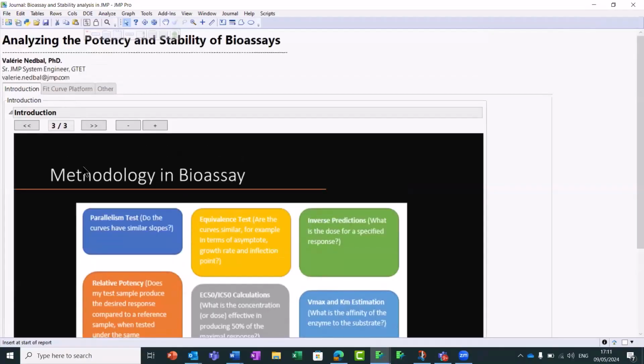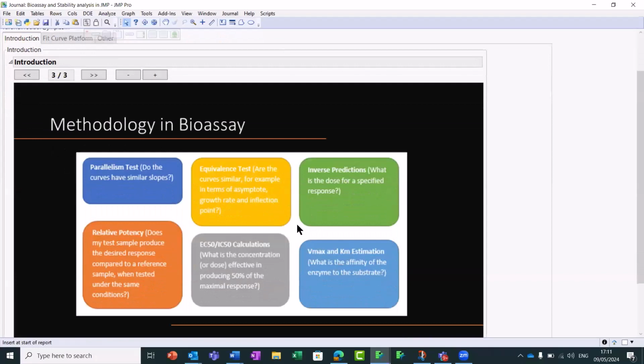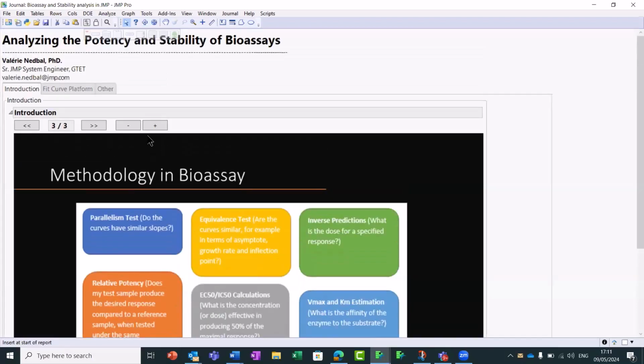First of all, where do you find all those different things? You might apply those response types of analysis. Those responses are obviously not linear. It could be linear, but I would say in 90% of the cases they are non-linear models. And of course, you will not be able to use linear models to answer those questions.